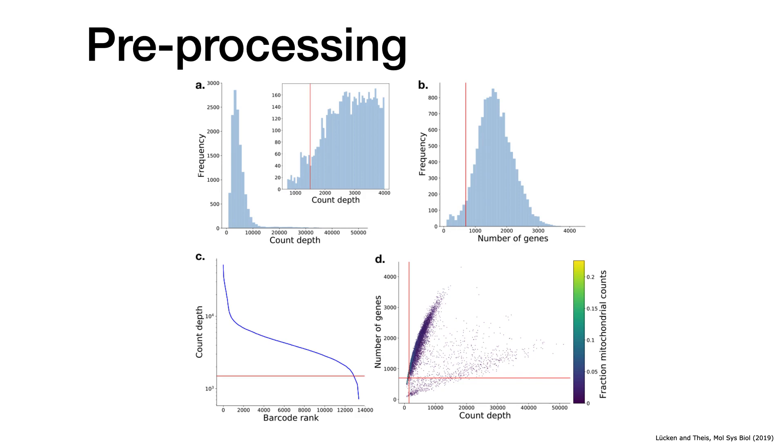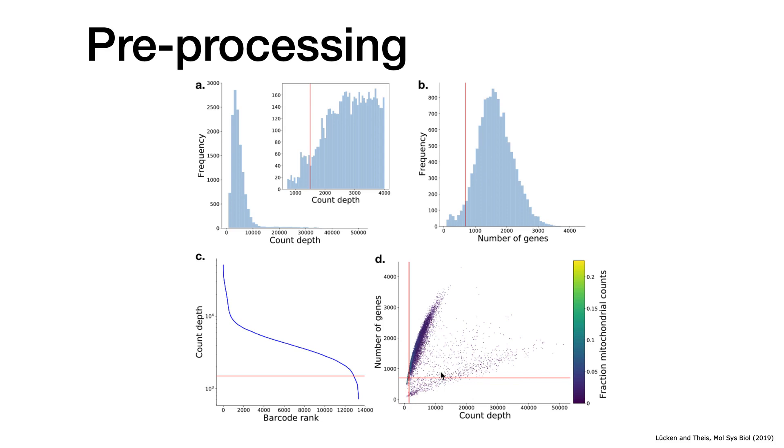A different way of looking at cutting and making thresholds is to make these 2D scatter plots. Here we depicted the number of genes versus the count depth, so total number of reads. And you can see that you have these kind of lines here. So sometimes you do have this kind of a V shape. I just draw it with my mask.